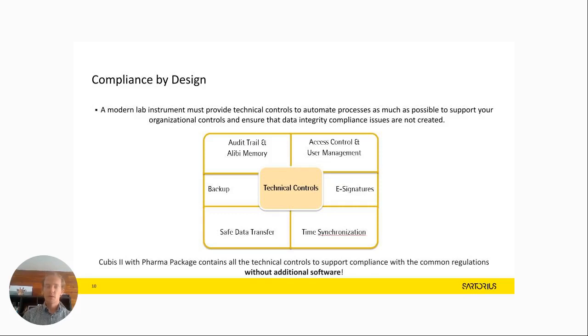Safe data transfer. Do you have a backup? Will every data get backed up into your server? So if something, maybe an electricity shortage or something happens to your instrument, you know your data is somewhere safe. The backup. For the safe data transfer, when you transfer data to your backup, can someone access that data? Can someone change the files? All of that is in safe data transfer. The backup, as I mentioned, every 8 hours or every morning or every evening, will your data, which you have on the instrument, be backed up in your network or cloud or what else?